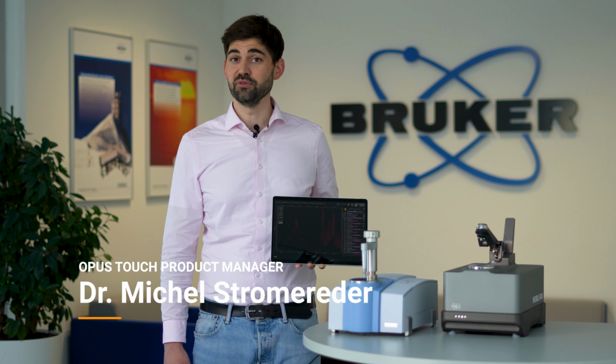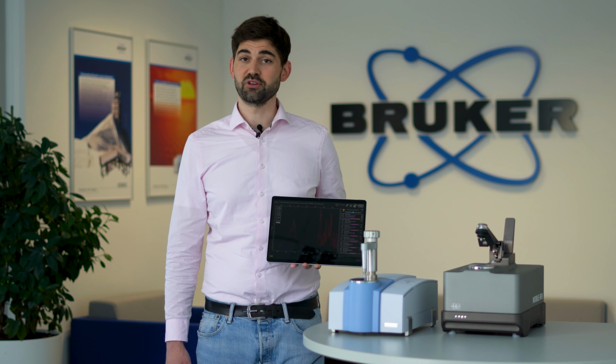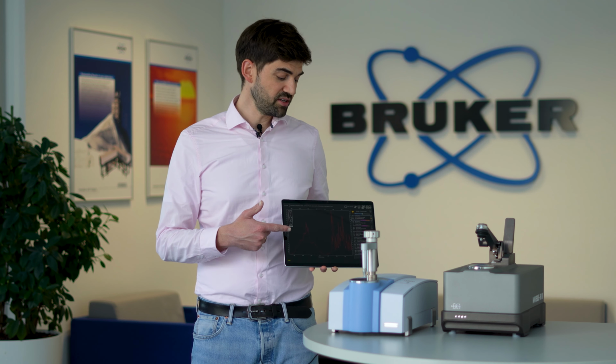Happy release day! OPUS TOUCH 6 introduces several new features that enhance its dominant position as the go-to FTIR spectroscopy software. Here is a quick overview.